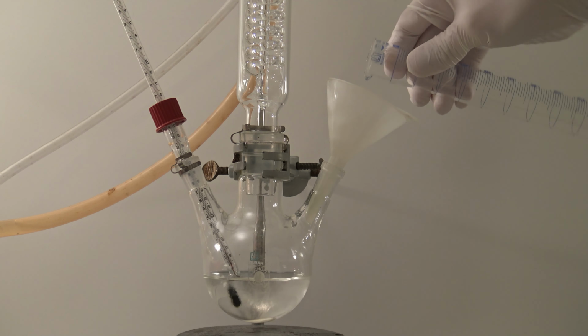Due to the small rise in temperature, the ice bath was removed. Otherwise, this could lead to the hydroxide solution being added completely before the reaction unexpectedly begins. The heat of the reaction could then be released very quickly so that the cooling would be insufficient. This is called a runaway reaction.